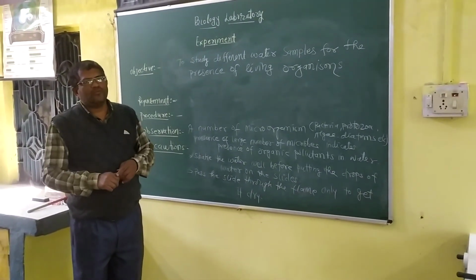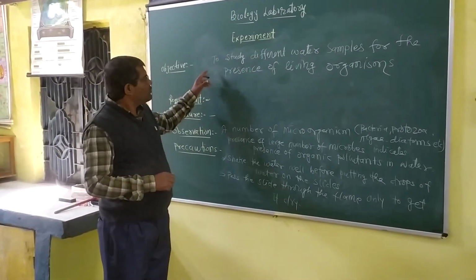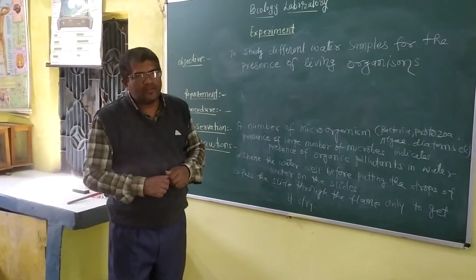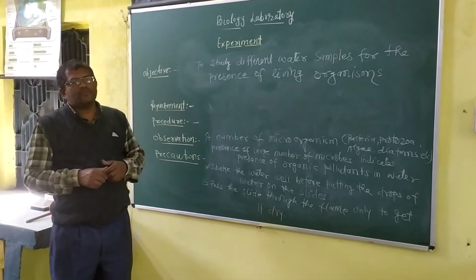So this is all about the experiment to study different water samples for the presence of living organisms, and you have to draw the diagrams of some microbes.